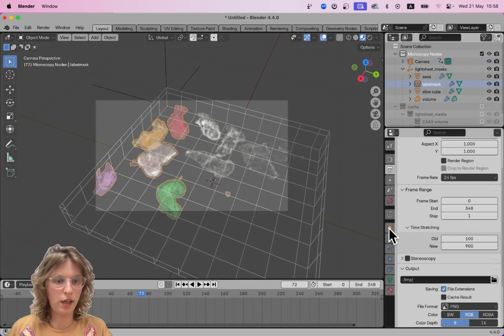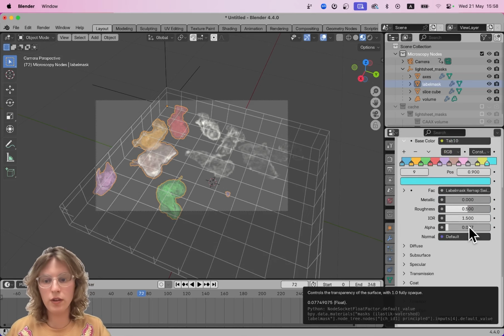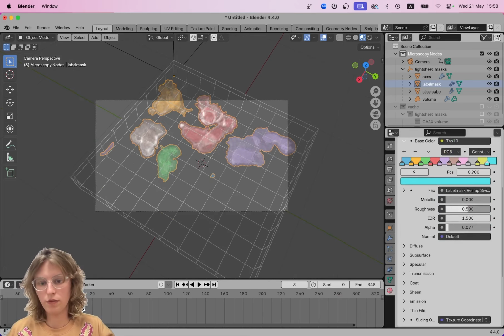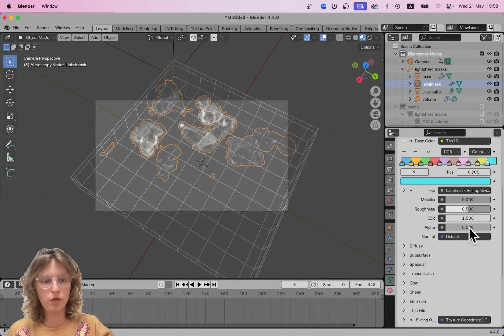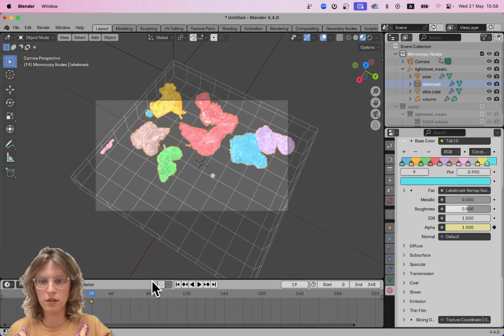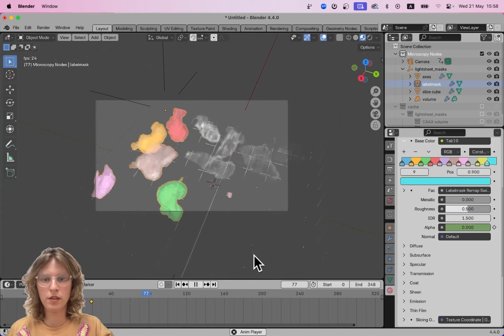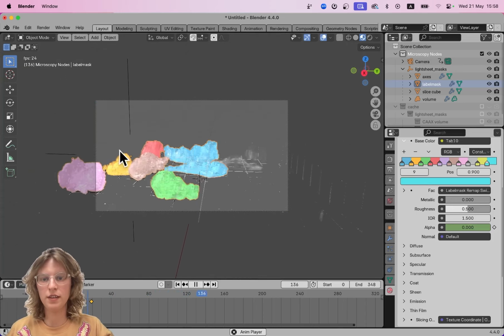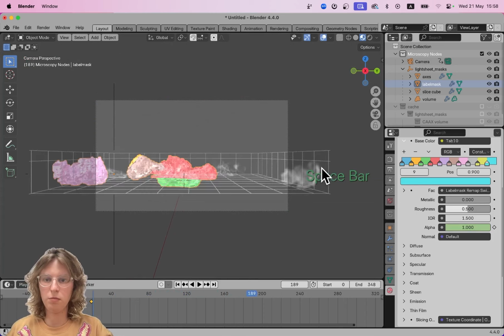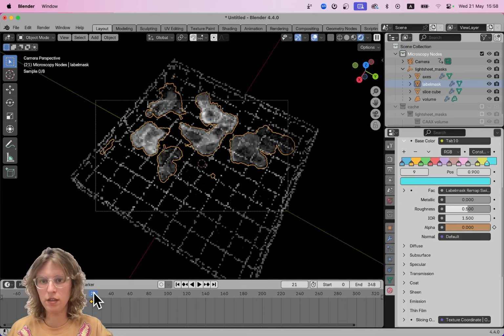You could animate not just the slicing, but also your alpha value where you start. Let's put a keyframe here at 0 alpha, and then we slowly come up to 1. And remember that this is time stretched, so it will take slightly longer. And we can see that there's the transition that we hope. Here, in the ray traced, we actually get the occlusion correctly.